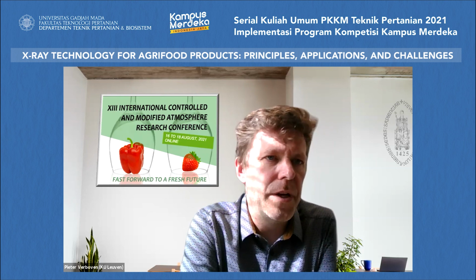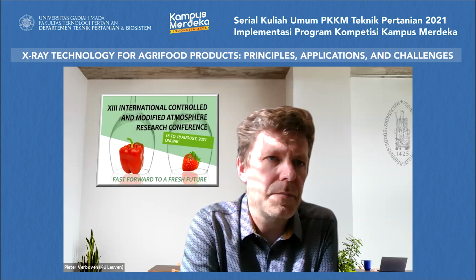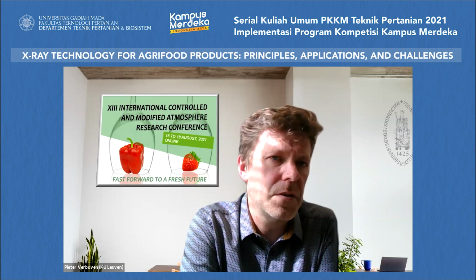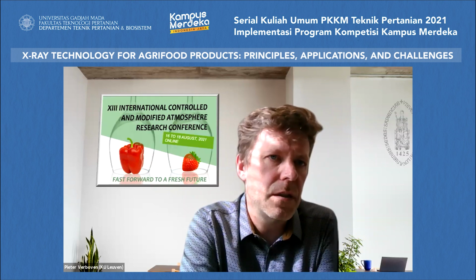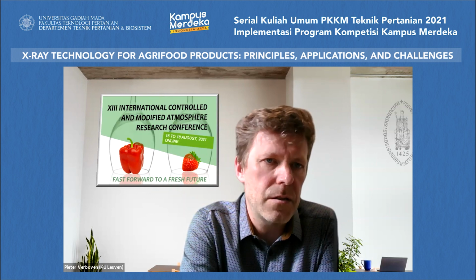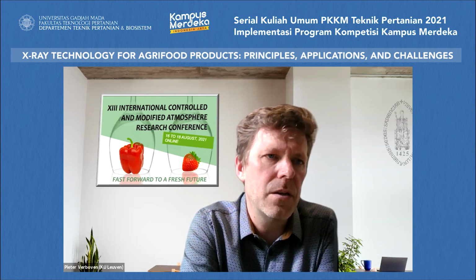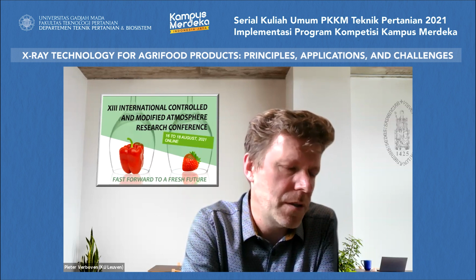So that's a whole other range. I see also the first question is about the setting parameters of our systems. Of course, we're using imaging systems, so we need low intensity, often below 60 kilovolt. Exposure times are very short. So it in no way relates to applications where you want to use it for sterilization. I cannot really comment on applications for sterilization because we have no experience with that.